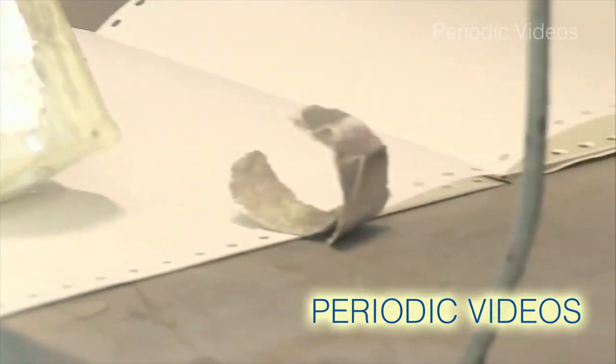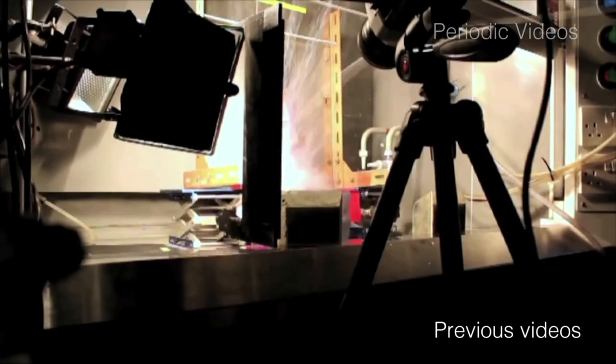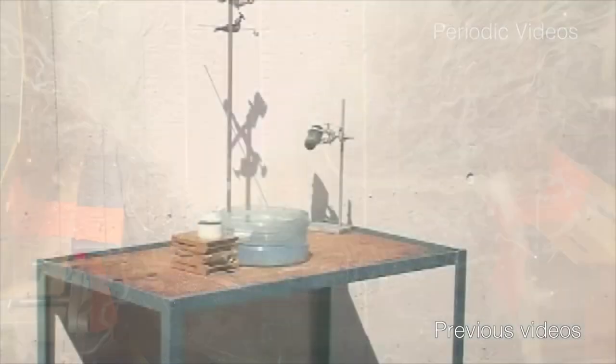We've done lots of experiments with the alkali metals. We'll pop it into the water and see what we can do with the reaction. You can see the orange sodium flame. But our technician Neil felt that we weren't really doing them scientifically enough — we were just dropping alkali metals into water and seeing what happened.